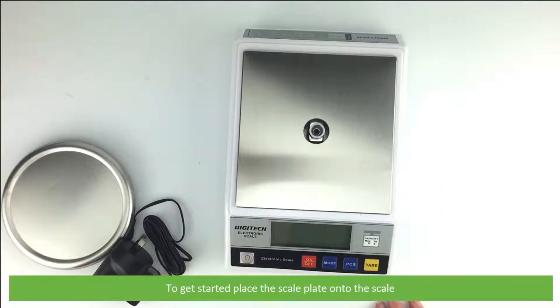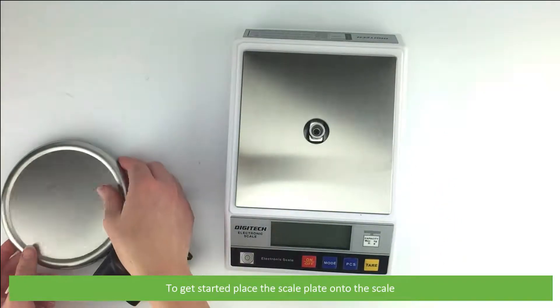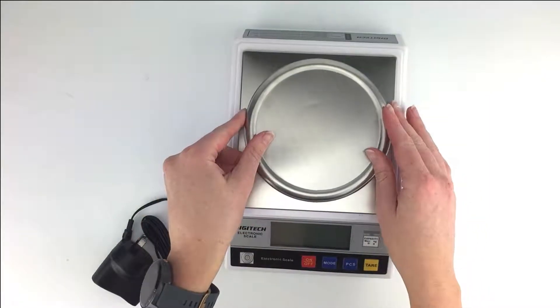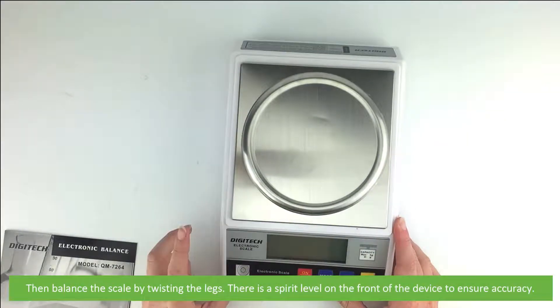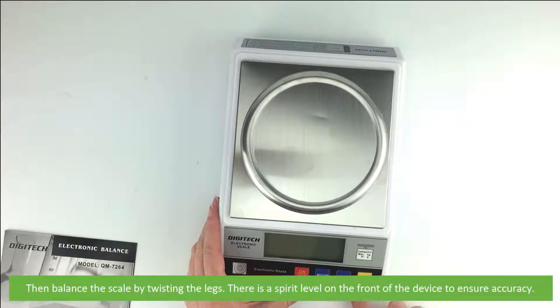To get started, place the scale plate onto the scale. Then balance the scale by twisting the legs. There is a spirit level on the front of the device to ensure accuracy.